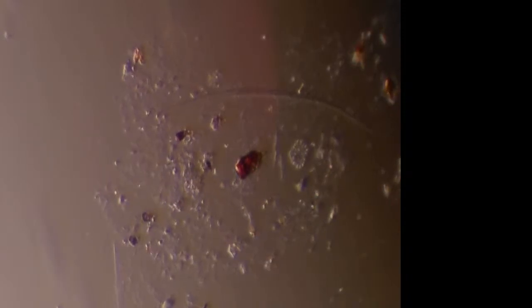See that red color very often in protozoans or even multicellular animals like a copepod called cyclops. That might be the red eye spot of a cyclops.